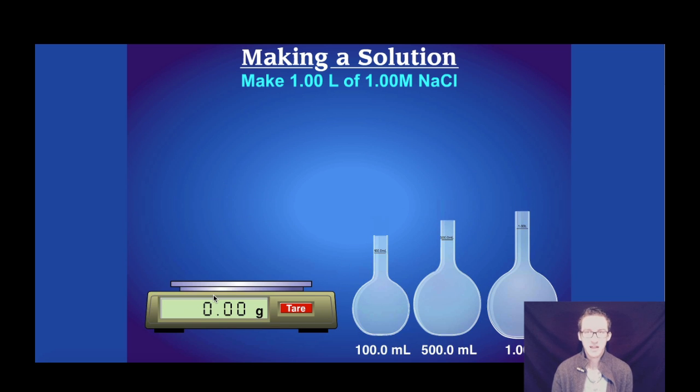So the first thing we want to do is pick our what's called volumetric flask, which are these sort of round looking flasks that are specifically designed for creating solutions with very specific concentrations. Because we want one liter of this solution, we're going to choose the one liter flask.